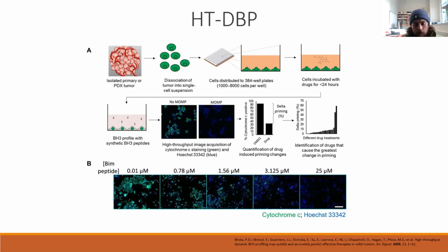Right. And I know too, sometimes I had issues with background, at least when I was doing immunocytochemistry, like the illumination, the background can change from the center of the field of view towards the edges. So I might look at their protocol to see what corrections they did and if they used any programs to automate that, because it would take a lot to analyze all of those wells, like 384 well plates. So it'd be nice to know how they did it.